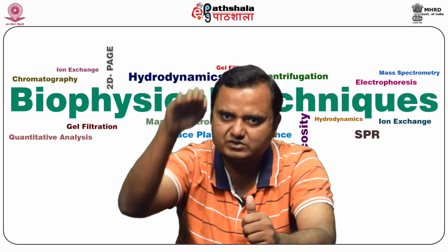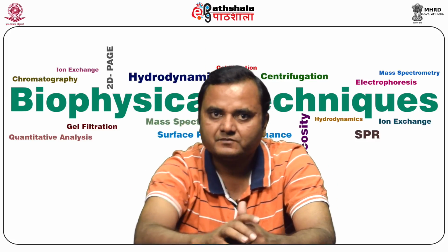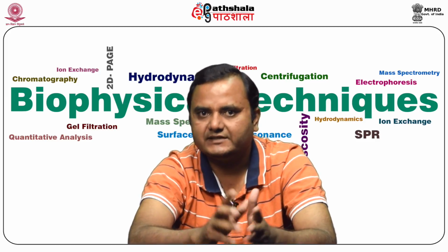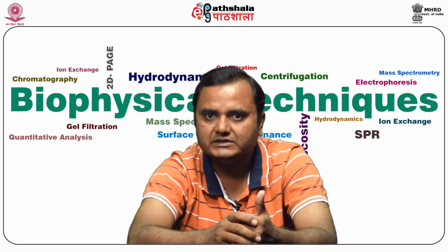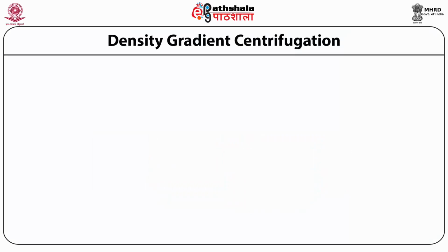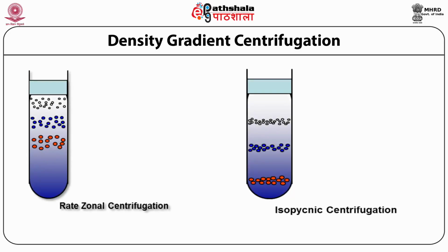So the purpose is to separate molecules based on density by creating a particular density gradient. There are different types of media used to create the density gradient, depending upon the desired outcome. The density gradient can be established in a tube either in a rate-zonal or in an isopycnic way. Generally there are two types of density gradient centrifugation: one is rate or zonal centrifugation, the other is isopycnic centrifugation.